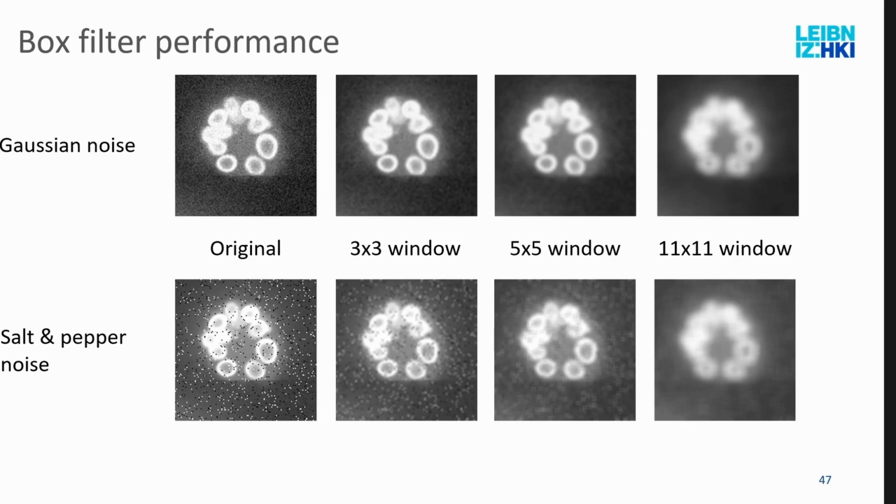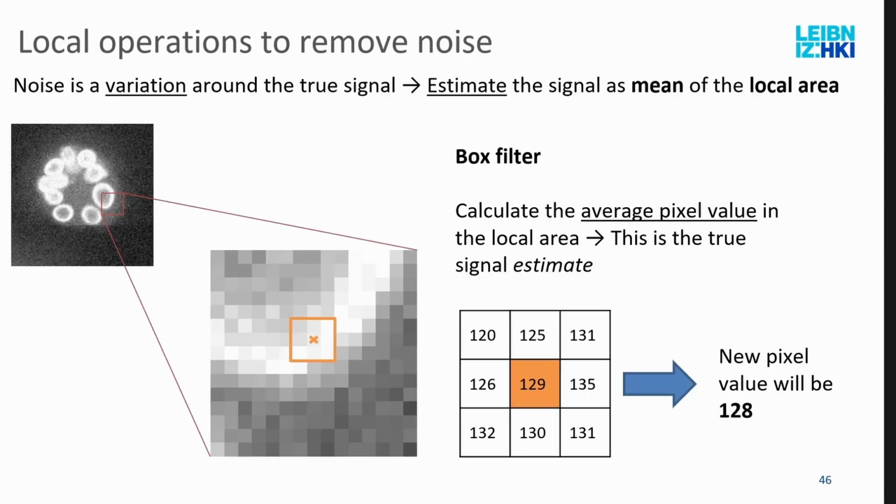So the box filter in this case is not perfect in performance as you probably want. How does the box filter handle pixels at the edge of the image where the box would leave them? Yeah, this is a good question because it's not defined. When it's on the edge, imagine this is the edge and then we are going out of the image. Then the tool itself that implements it defines something.